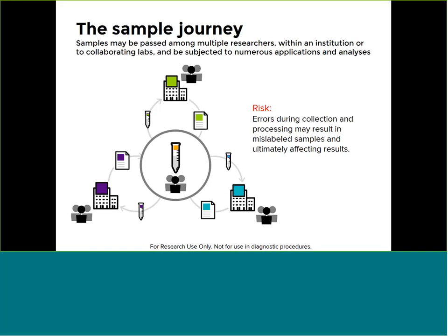I would like then to call out the inherent risk throughout this journey, as Jianhong has also mentioned in her presentation, which includes potential sample mislabeling errors, sample mix-ups or swaps, or even contamination of one sample with another. All of these potential errors could have a negative impact on the results.